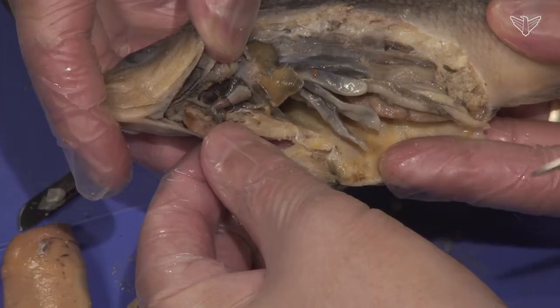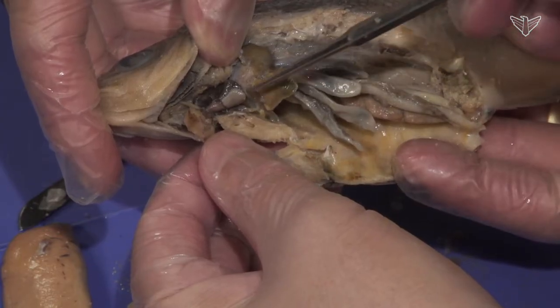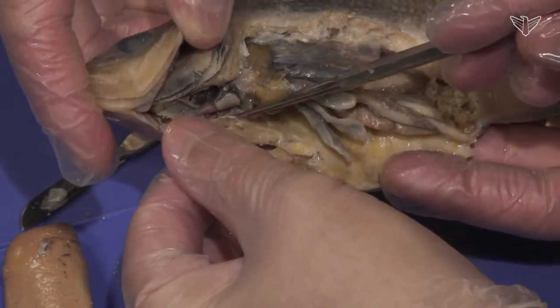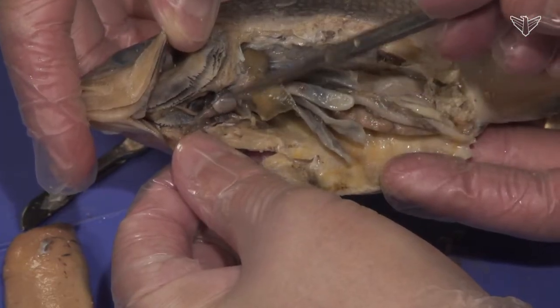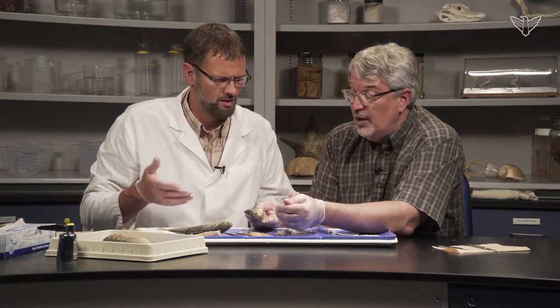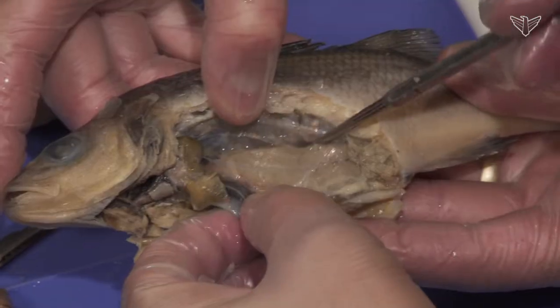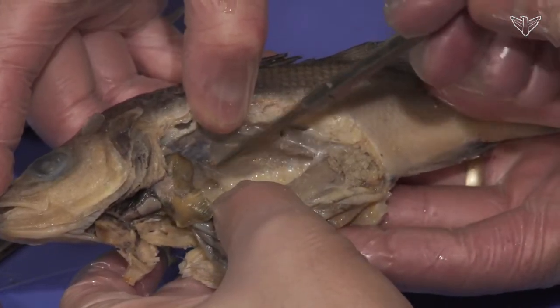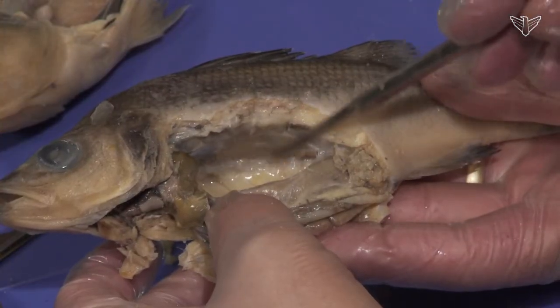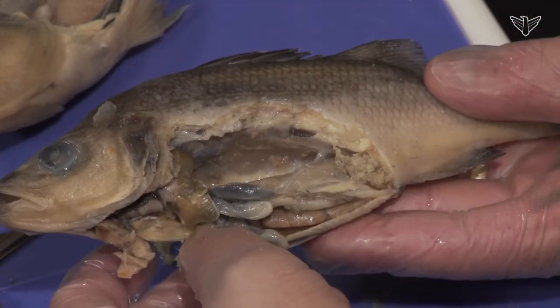Once blood picks up oxygen in the gills, it goes out and delivers that oxygen to the tissues. Deoxygenated blood comes back in on this side into the atrium, into the ventricle, back to the gills — a small heart by other vertebrate standards, but important in moving blood quickly to deliver oxygen, allowing for greater movement and activity. The kidneys are hard to see — they're lining the back of the animal, actually in the wall itself — and they produce urine that then goes out through the cloacal area.